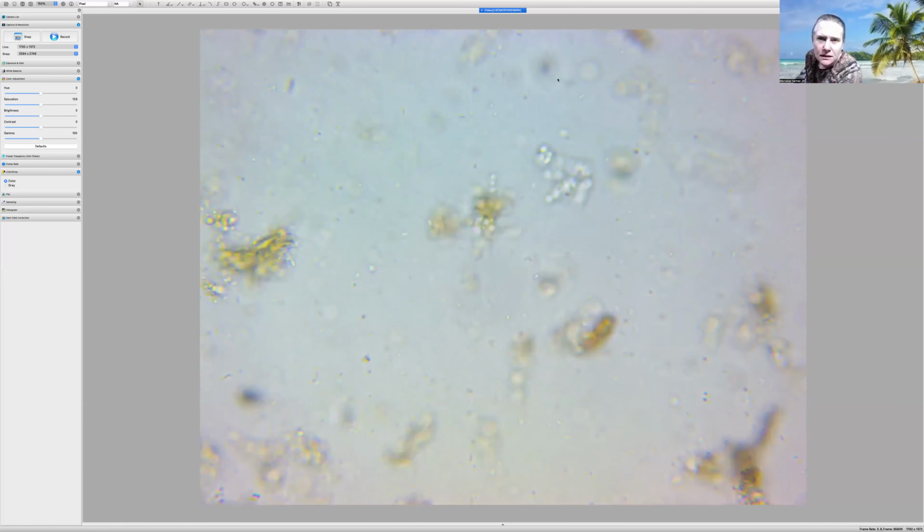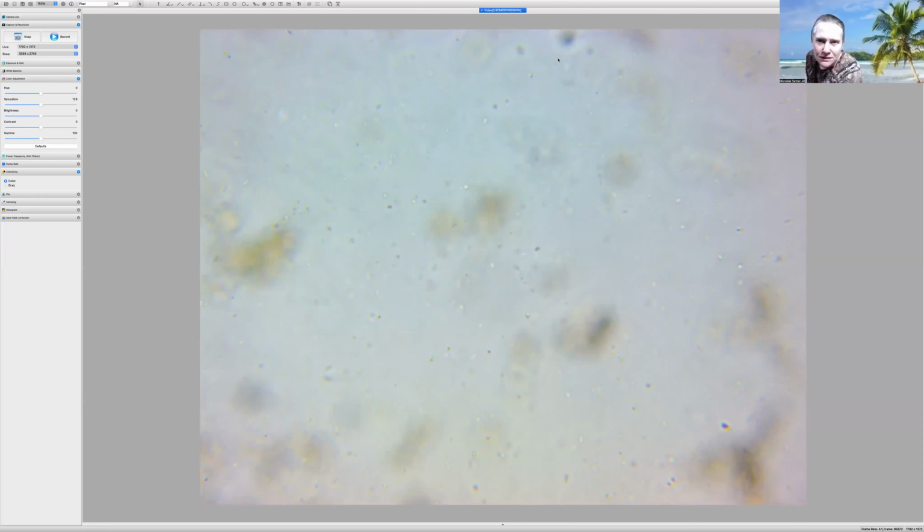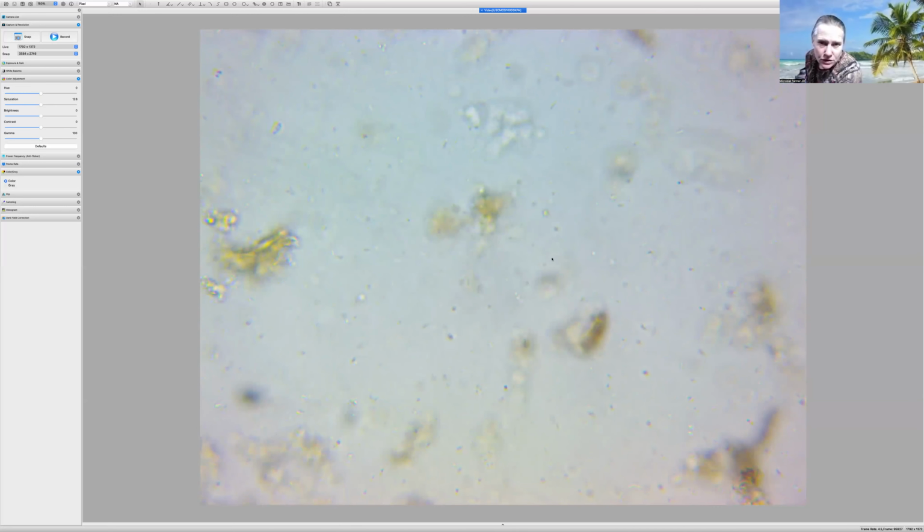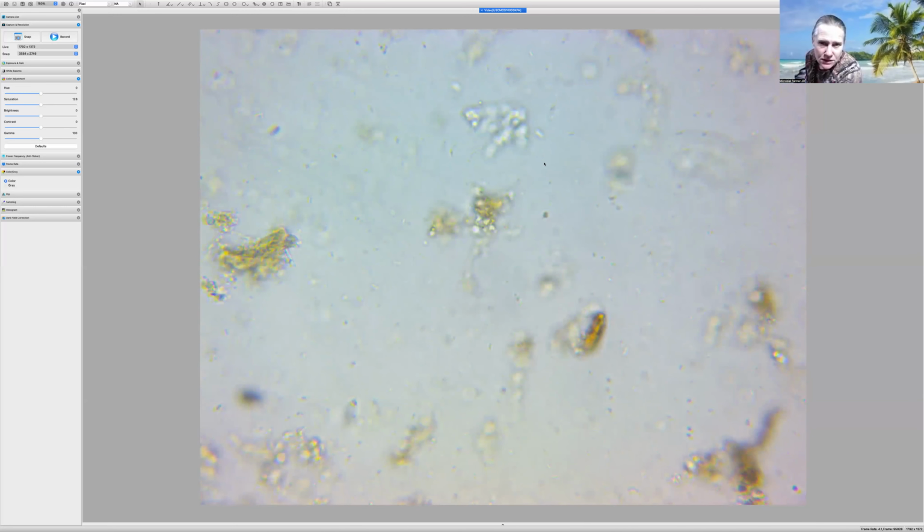So there, now I'm up at the top. It's hard to focus this fast. And now he's moved off. All these little specks here are our bacterias. We don't count them right at this strength. We dilute. We can see about 30 bacteria per screen.